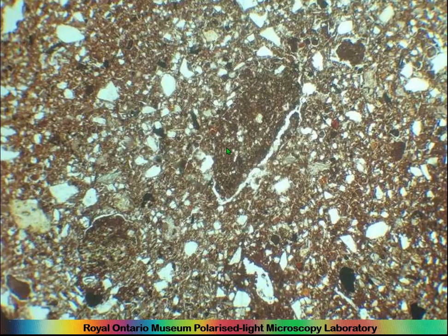Here's another thing, and sometimes you'll find these things are not as obvious as you think. Typically, if it's something that's been added, like grog, it's been crushed to about the same size, more or less, and added, and so there's a distinct amount of it. If you find one teeny bit, or even one quite big bit, it probably isn't grog, because they're not going to get a bit and throw it in. Now this has something that you might think looks a bit like grog, especially on this side. The boundary's quite distinct. But you see on this side, it really sort of smooshes into the matrix.